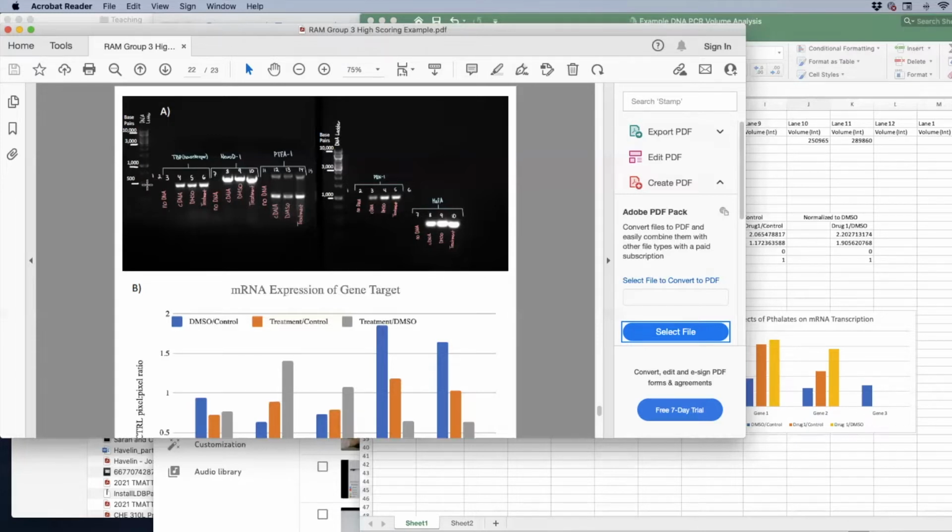So these bands right here, it looks like this is TBP, so everyone's going to have this on their gels. TBP is just shy of 500. And then this one over here, it looks like they did PDX1. It lines up with the 1,000 base pair chunk in the DNA ladder. So we know these DNA fragments are 1,000 base pairs.